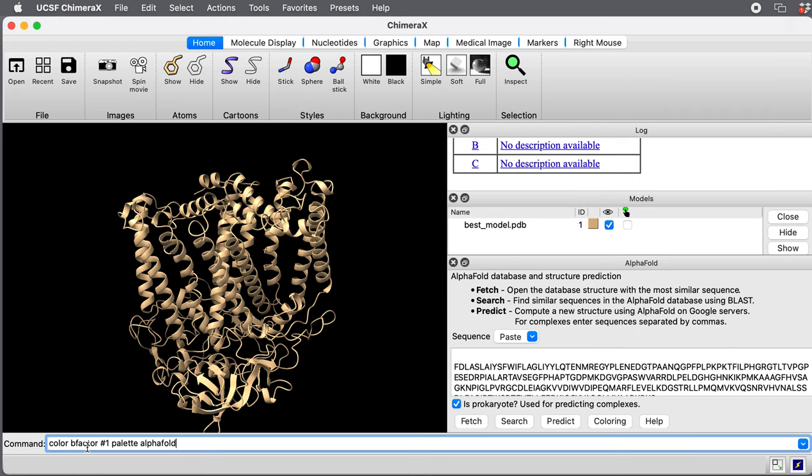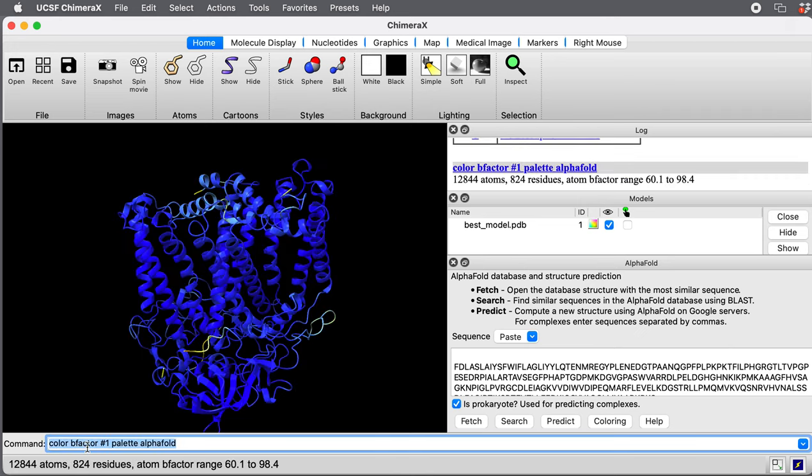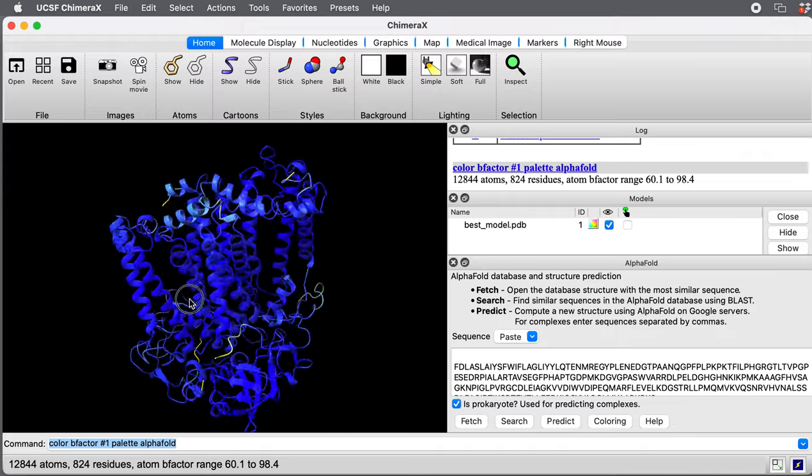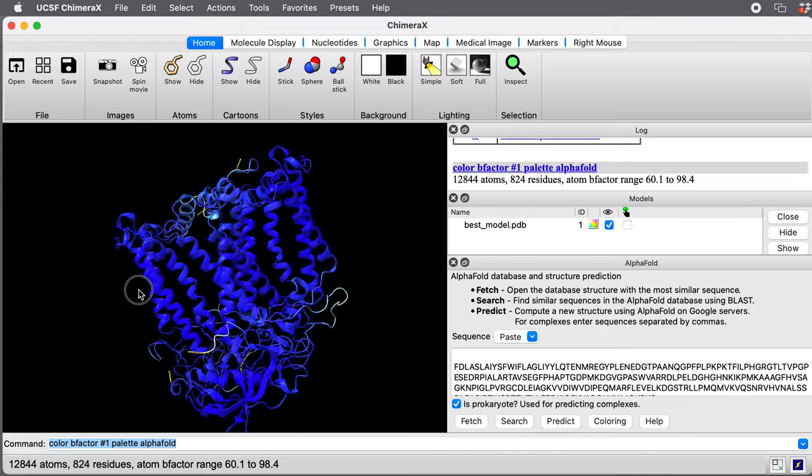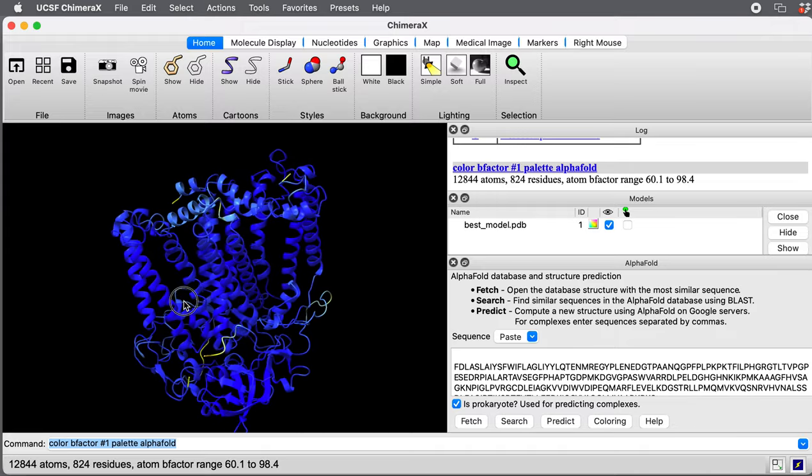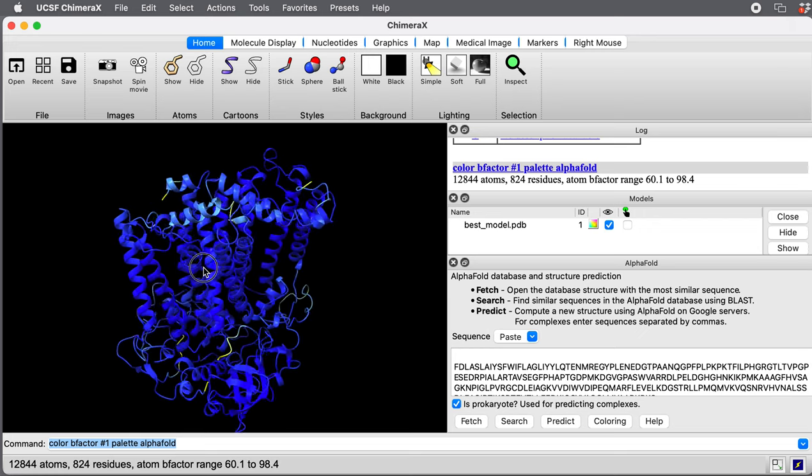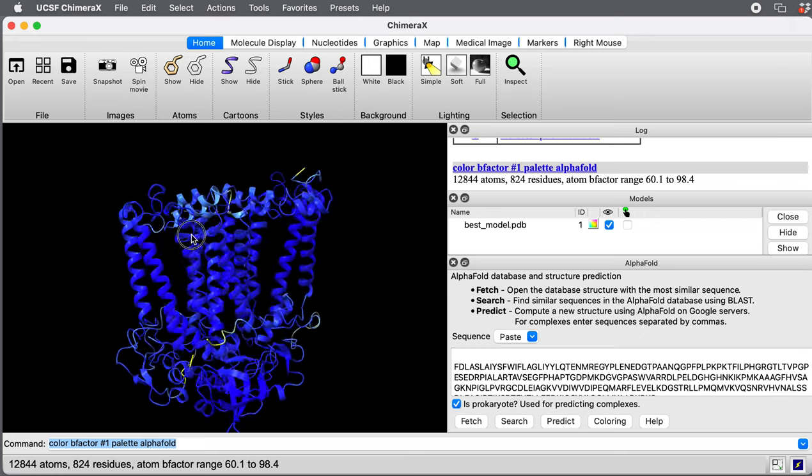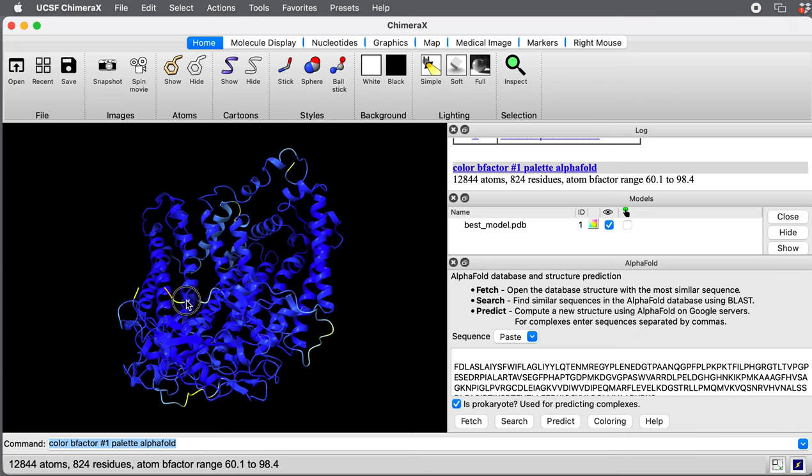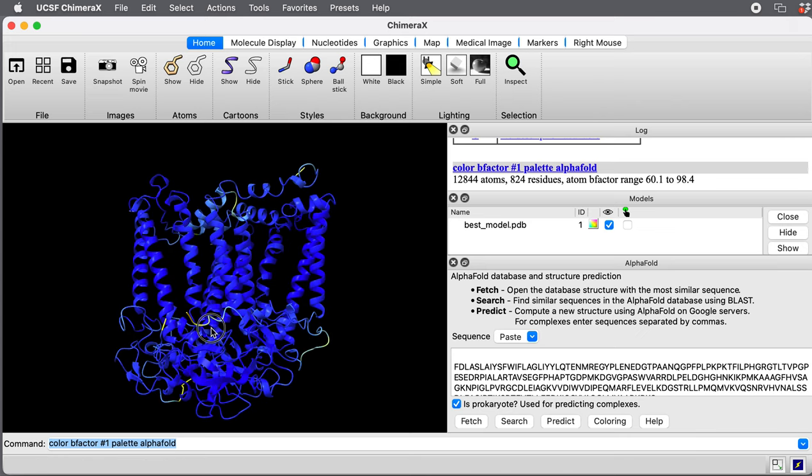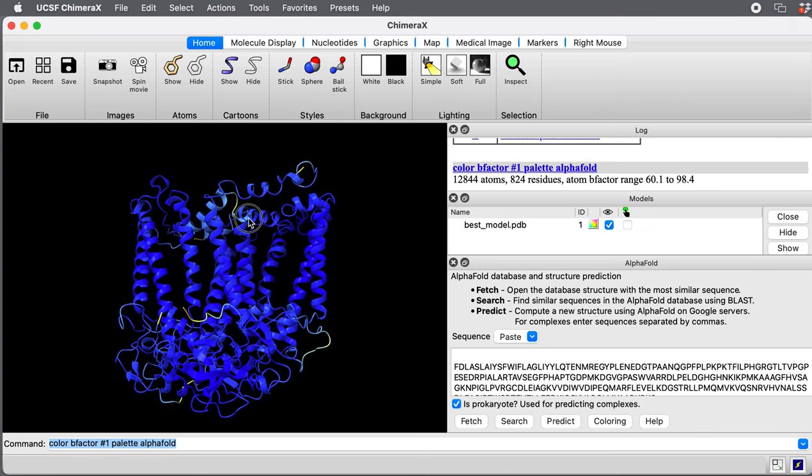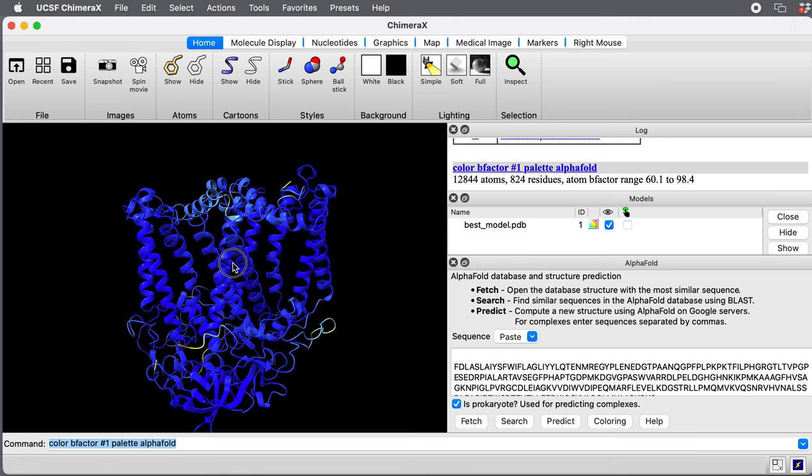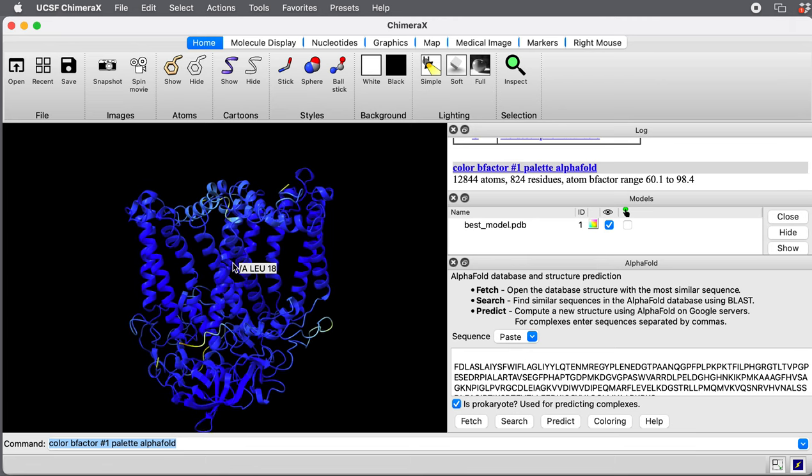This is just the AlphaFold coloring scheme. The confidence values go from zero to 100. 100 is blue. This is kind of an unusual case where it's all blue. It has very high confidence in almost all regions of this structure. The lighter orangish, yellowish, and reddish colors are areas it's not so confident in. So it's very confident in this prediction.